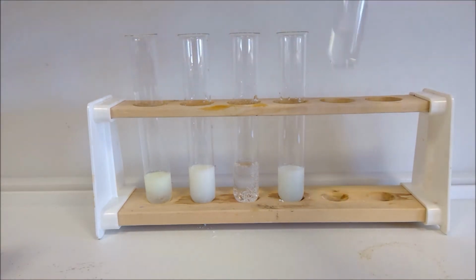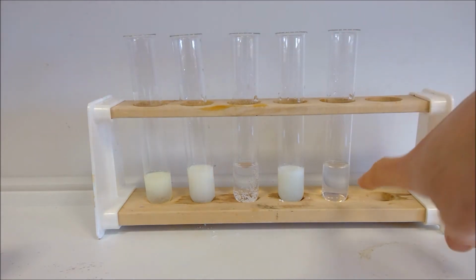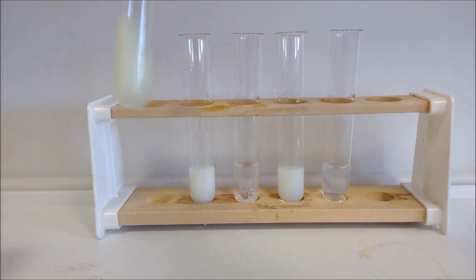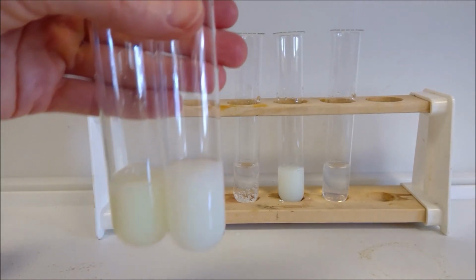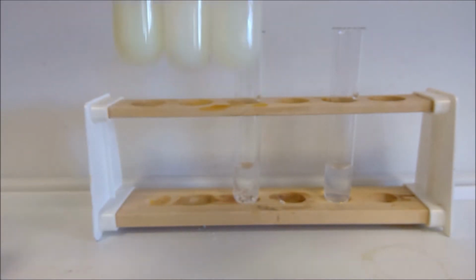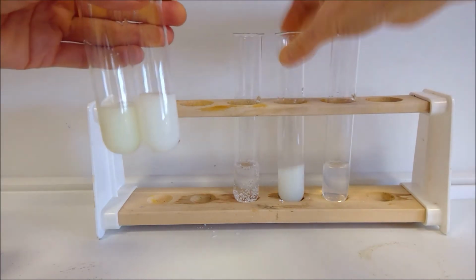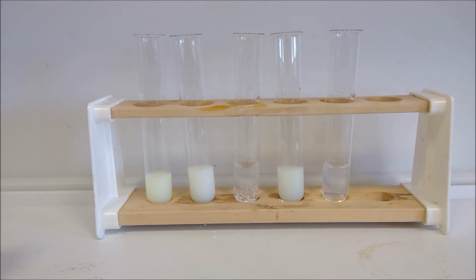Okay, so we've got no change in our final solution there in number 5, and then we need to have a careful look at 1, 2 and 4, and then decide which colours we're going for each of these. Okay, so that's 1 and 2 next to each other, and let me bring in 4 as well. I'll hold them up to the white behind. Can you see that there? Okay, so note down your observations there and then decide on any conclusions.